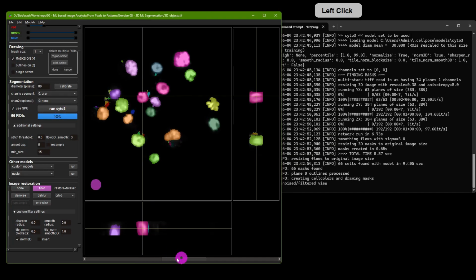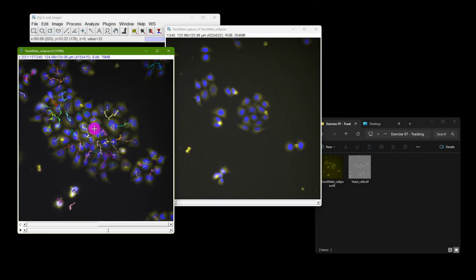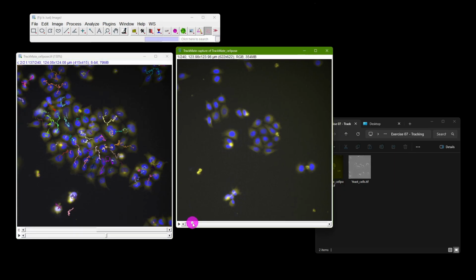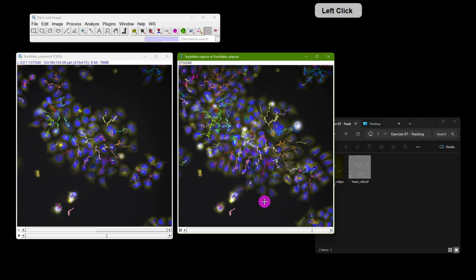In the second bonus section, you'll learn how to connect all the machine learning tools explored in the course with object tracking in Fiji. You'll examine various options, understand their advantages, and be aware of potential pitfalls.